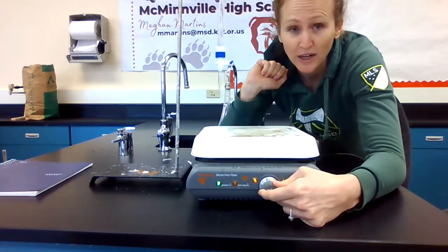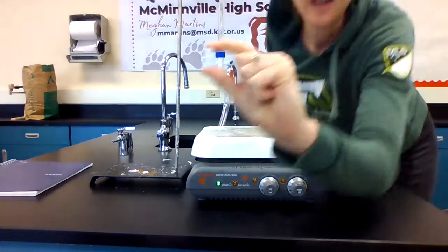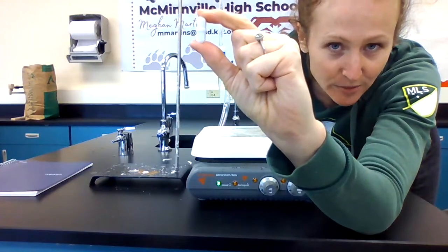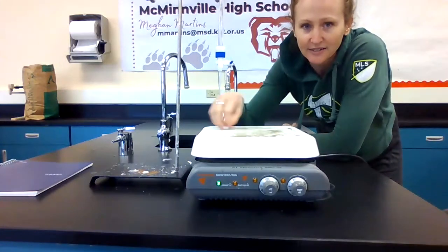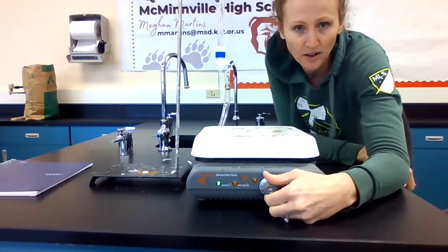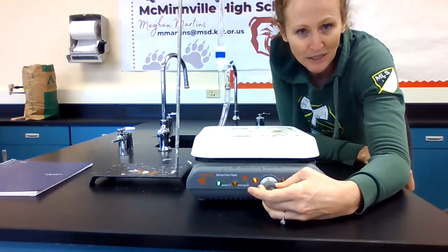The other button here is your stir function. In order to operate our stir function, we need another piece of equipment, which is this one. This is called a stir bar. It's a magnetic stir bar. You'll see that it's attracted to a specific part on the plate, and if it's in that specific part on the plate, I can turn this and get it to spin.